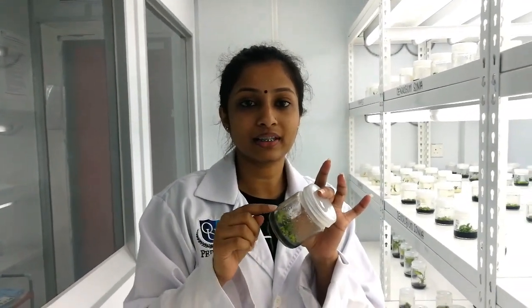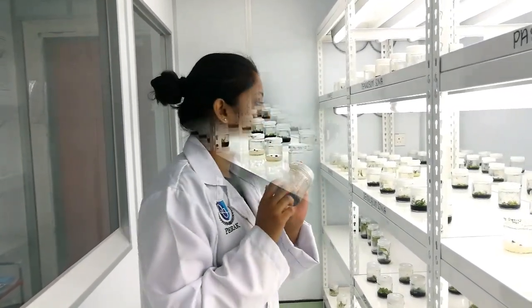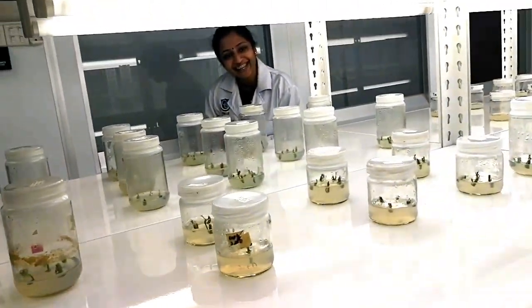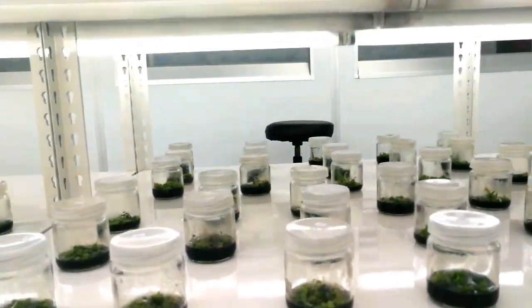Callus forms with an equal concentration of hormones. My plant is Alocasia species. It's a wild species. It's collected from Cameron Highlands. We will be culturing over here in Plant Tissue Culture Room.